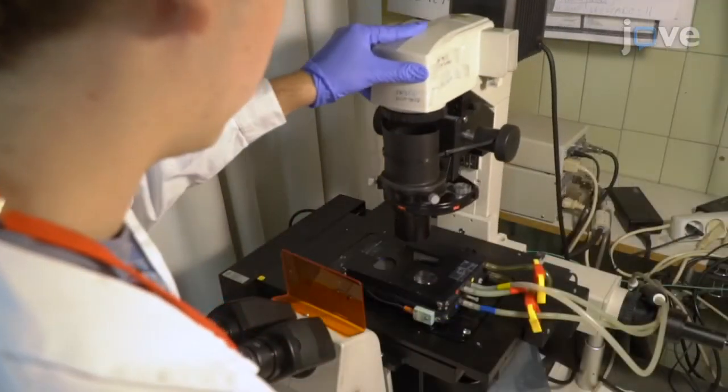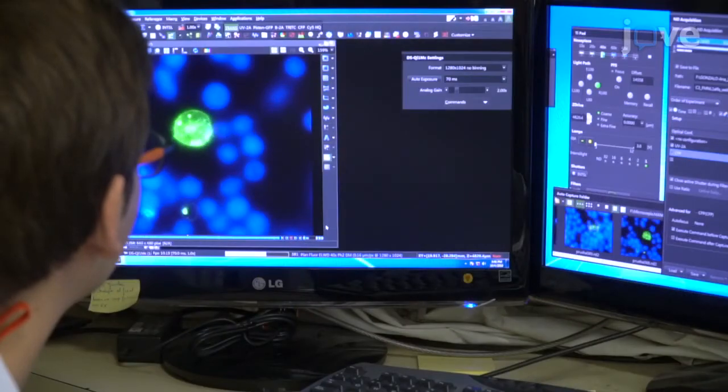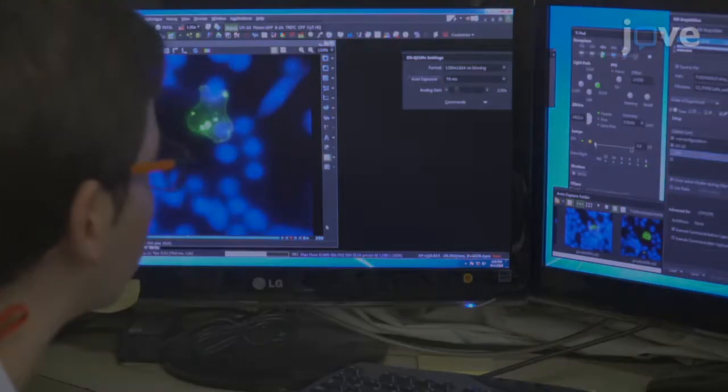Locate the chamber slide on the microscope stage incubator and select some appropriate fields. Prepare the microscope and incubation chamber prior to imaging. After the Jurkat cells have been added to each well containing the Raji cells, quickly locate the microwell chamber slide on the preheated microscope stage incubator and select some XY positions.